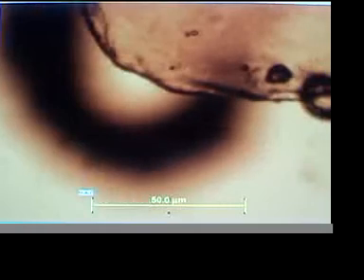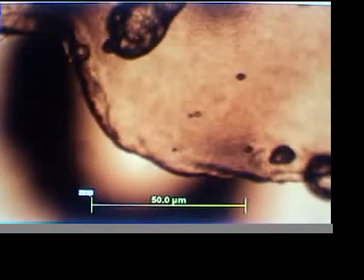Okay, introducing a new kind of microscope slide which has a grid. Unfortunately, the video camera blows up the center of the slide so big. That's the letter A, and you can see a Blepharisma swimming around it. So we have A, B. Trust me, looking through the scope, you really can see it. Here's the letter C. See if you can get a D. Here's the letter, look at that Blepharisma swimming on the letter E. Isn't that hilarious? E, F, G, H, and the letter I has many Blepharisma.